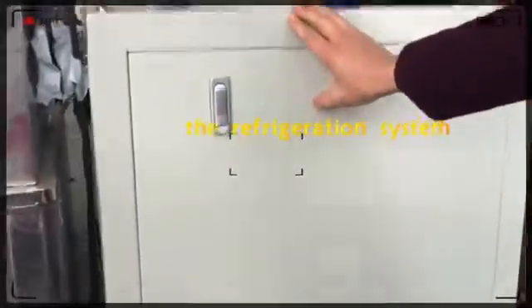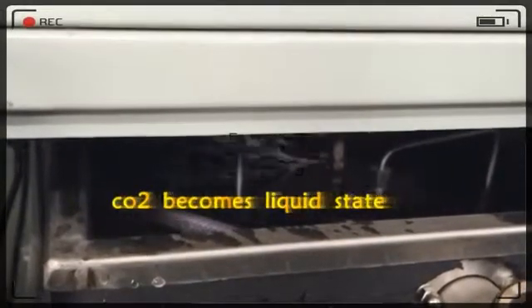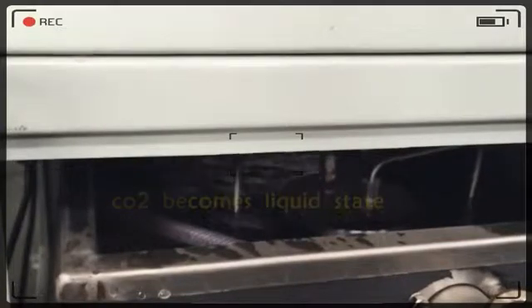This is the cooling and refrigeration system. Under here is a cooling tank, and inside of the cooling tank there is a storage tank of CO2. The CO2 comes from the bottle and goes to this tank first, to let the CO2 become liquid CO2 under cooling conditions.